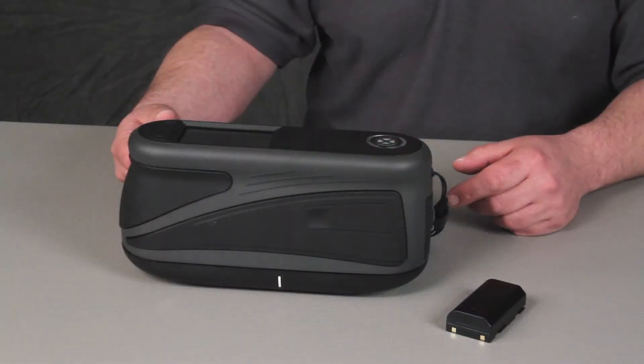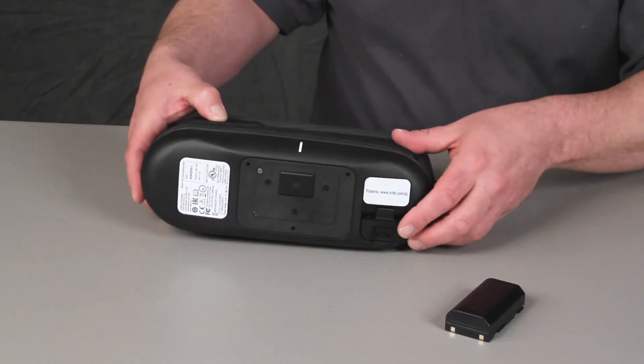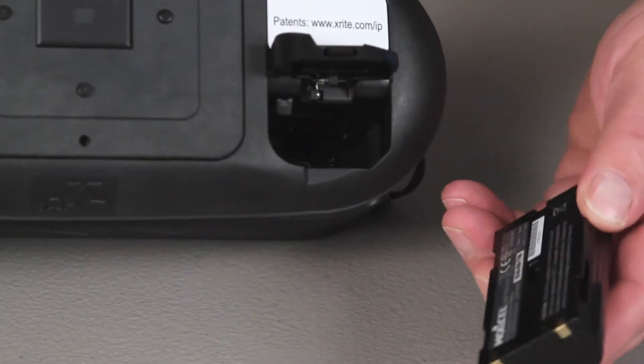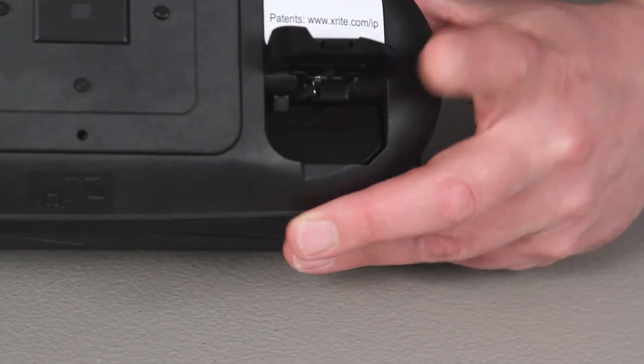Your instrument ships with the battery pack removed. To install the battery, carefully turn your instrument over and open the latch securing the access cover. Insert the battery with the battery contacts facing down until it latches into place. Close the access cover.